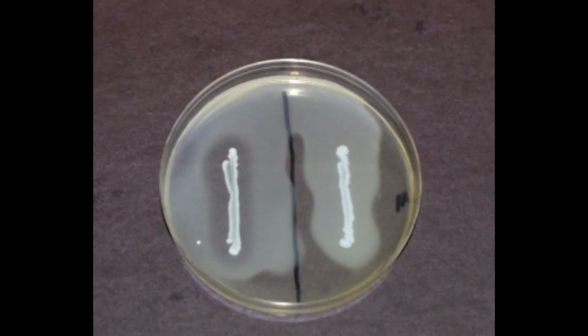In one half, we will streak the bacteria which we know secretes alpha amylase, the amylase positive bacteria, and on the other half we will streak the amylase negative bacteria to see how this reaction goes. After the streaking, we keep this plate in the inverted position, incubated for 48 hours.